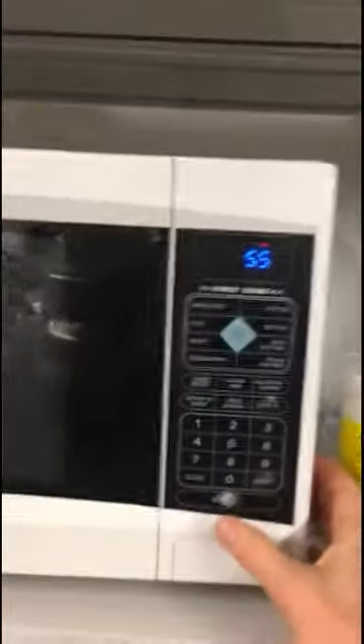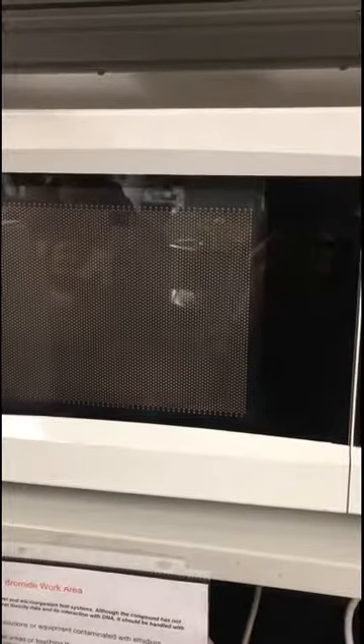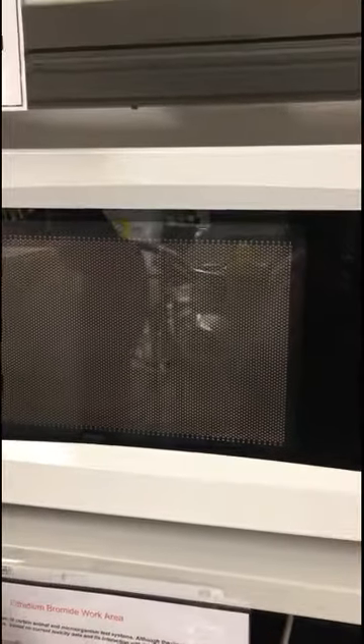We have this microwave set at 20% power. I recommend you only do it about 30 seconds at a time, and if you're doing it on full power, only maybe 10 or 20 seconds at a time. As soon as it starts bubbling, immediately stop it and check to see if it's liquid. Never microwave at full power — or any power — with the lid tightly capped. Best not to do it at full power at all. Check it to see if it's liquid; I still see a little bit of solid, so I'm going to heat it up some more.